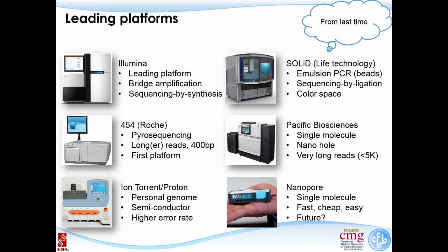The second technology we mentioned a little bit is SOLiD sequencing, which, well, probably there's only one sequencer now in North America, which fortunately is not us anymore. The amplification is emulsion PCR. We didn't go into any detail about that. And then the sequencing is by ligation. I did put a few backup slides in the last lecture. If you're interested, you can take a look at that.